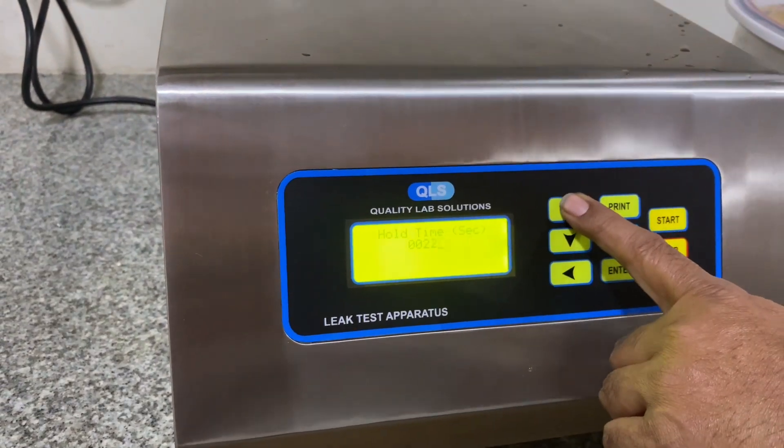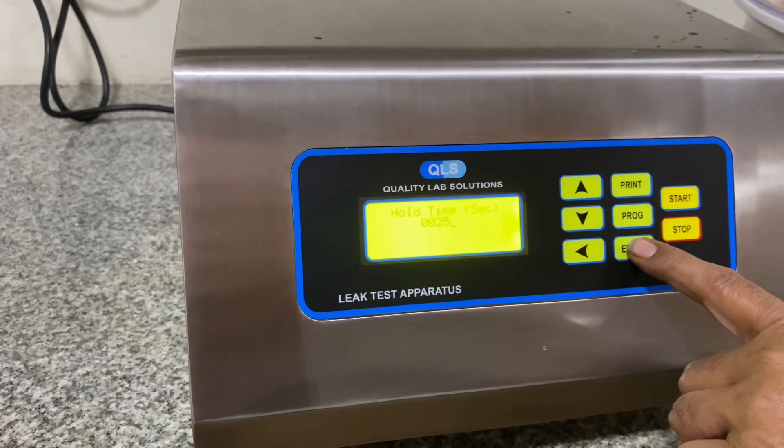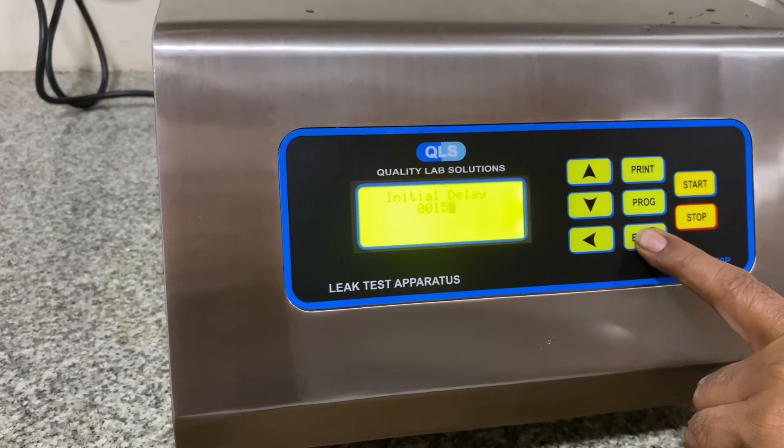The current vacuum is set at minus 300 mbar. The hold time is set to 22 to 25, and the initial delay is 15 seconds.